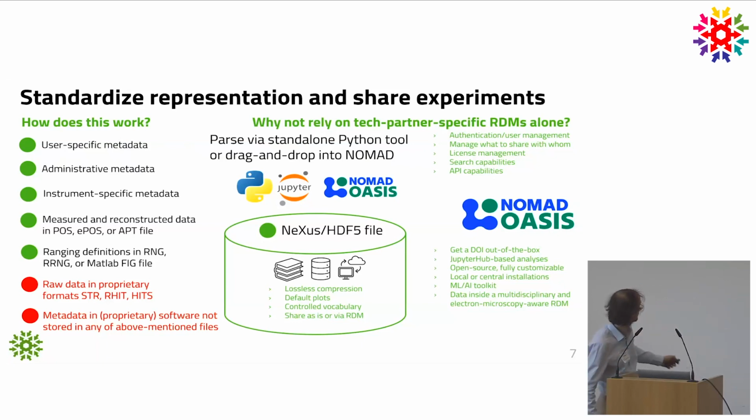But the only downside at the moment is that in fact the proprietary files, we ask all customers basically to upload also, so that they're not lost. We are positively hoping that at some point Cameca will understand that they should support us in our strategy, and then maybe they will also give us some more access or maybe even a library for that, or at least explain it to us, and with that we could technically implement it.